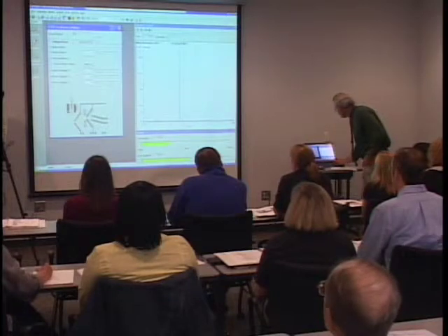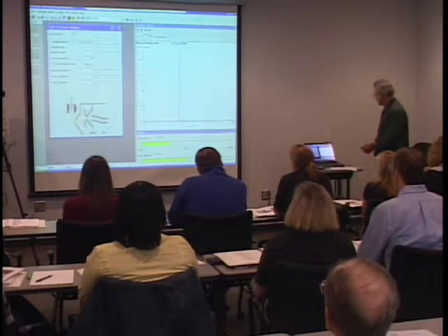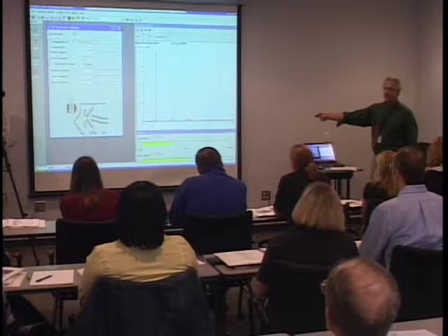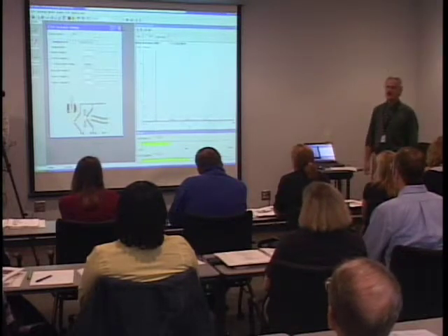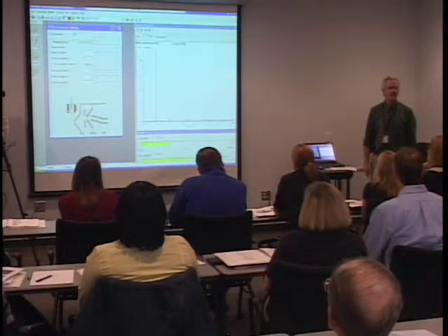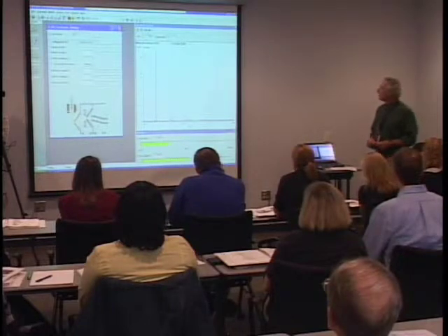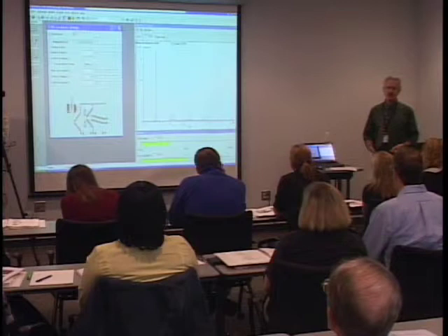Watch what happens if I raise the orifice voltage to 60 volts. There's a little delay while things catch up. You see the water dimer is broken apart to water monomer. If you had a more complicated molecule, you'd get more complicated fragmentation, but this shows you how things work and you'll see a lot more examples in Bob's talk. So we're going to go back to the standard conditions — I'm putting this back to 20. For today, I just want to measure things, not break anything apart yet.